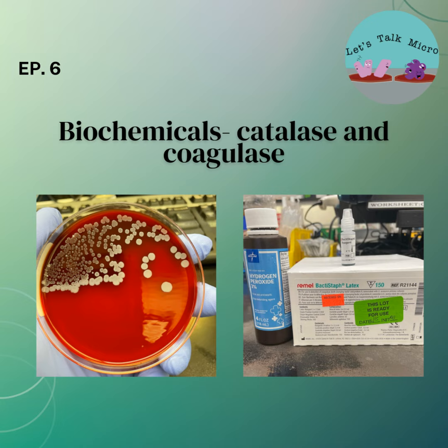That brings us to our next biochemical, which is the coagulase. So this is used to differentiate between Staph aureus, which is, if you were saying positive, you're right, and other staph, negative.